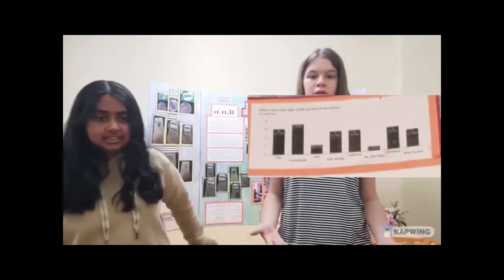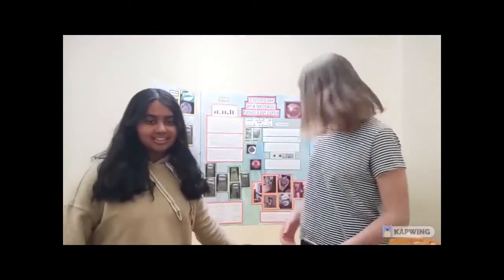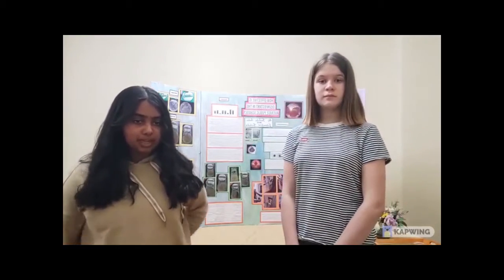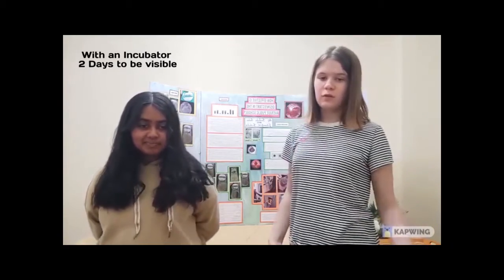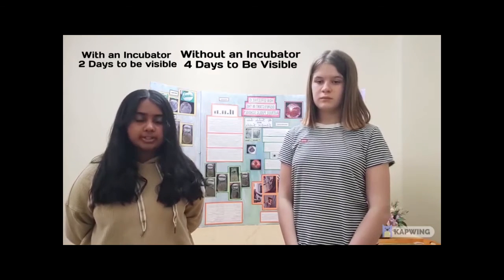To swab, you press the swab to a surface and rub it around so the sample gets all over the tip of the swab. You then take it back to the petri dish and rub it back and forth in this fashion. With an incubator, it takes around 2 days to grow, but it does not show the bacteria as clearly. Without an incubator, it takes 4 days to grow, but the growth is much more clear.